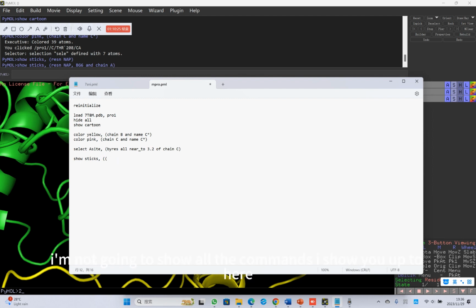I'm not going to show all the commands. I show you up to here. The rest you do yourself. Select A side. Why and what? I'm not here to troubleshoot your typo. Obviously, I guess this must be a typo. Selection, atoms.